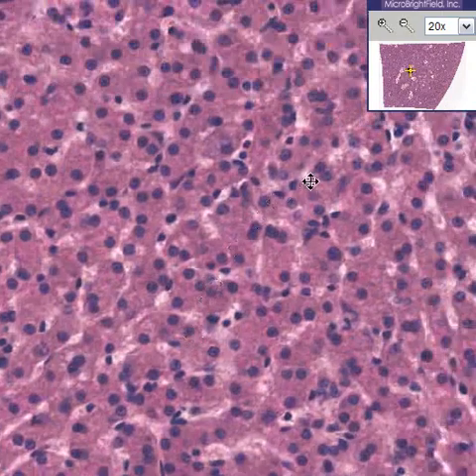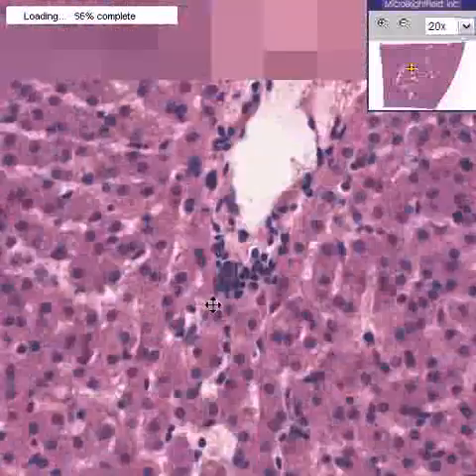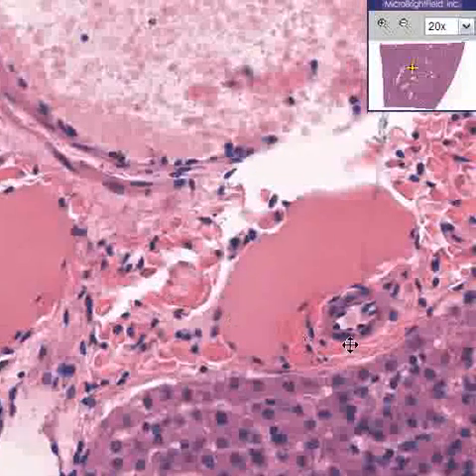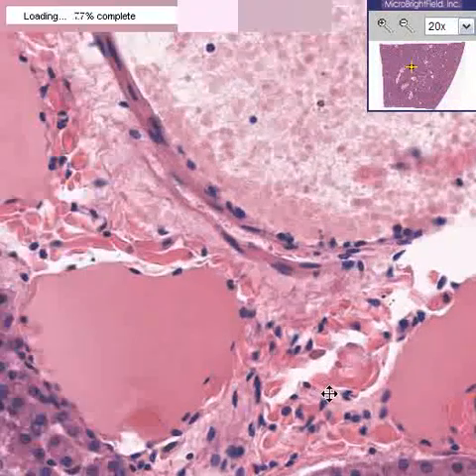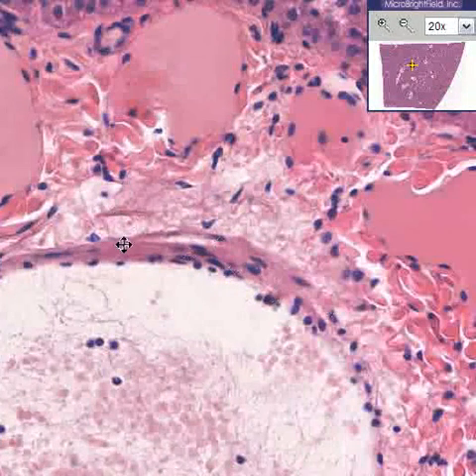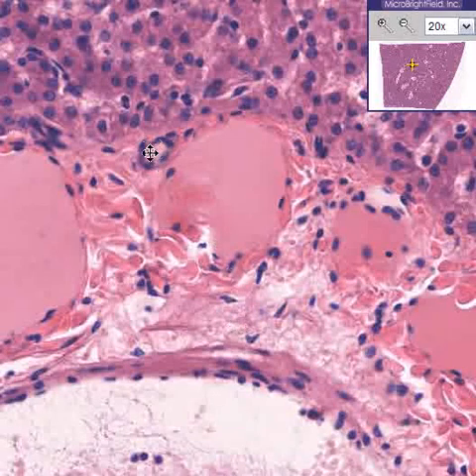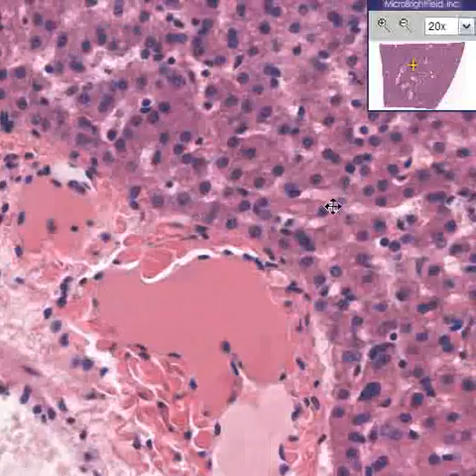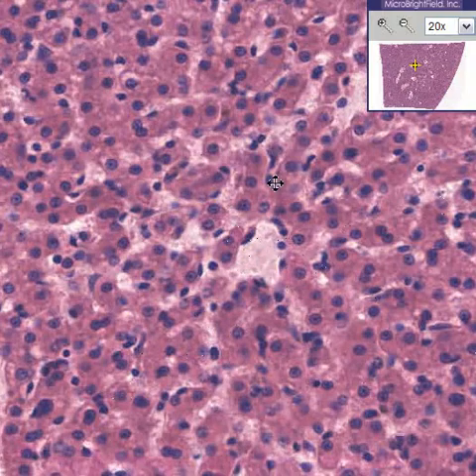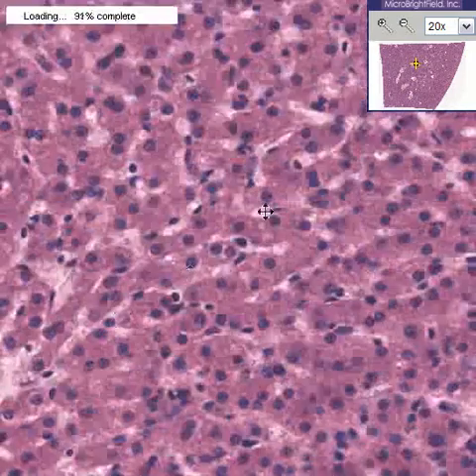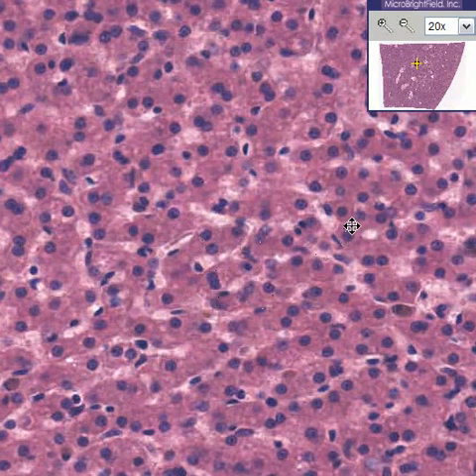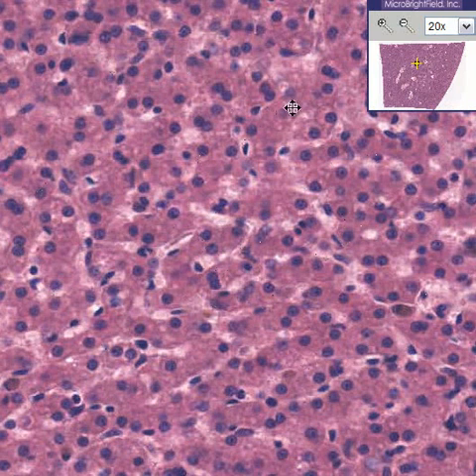There is no connective tissue around a central vein, but there is a lot of connective tissue around a portal vein — and not only that, but there's also a hepatic artery and a bile duct as well. This happens to be a large area: there's the smooth muscle of a portal vein, that's probably a little bile duct branch, and here are some more veins. See there's a central vein and the sinusoids are generally converging towards it. Here are some more sinusoids, hepatocytes, and Kupffer cells — those are the only three things you see in here.